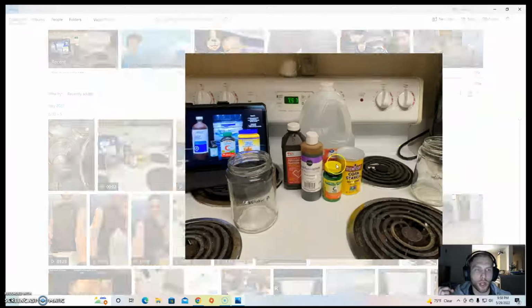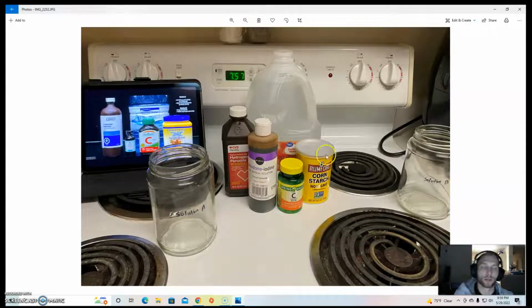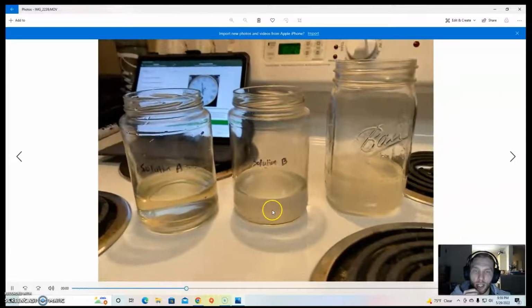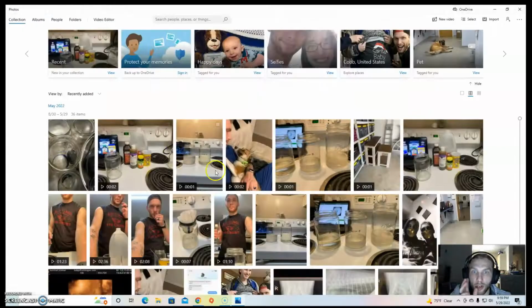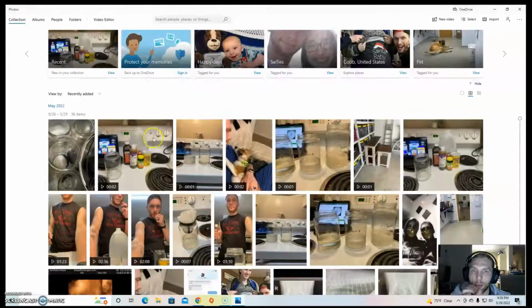This is just a quick view of the setup. It wasn't the greatest material or equipment, but it works. Ingredients. You can kind of see how cloudy this is filtered. It's not as clear as I'd like it to be. This was solution B, still pretty cloudy, and this was them mixed together. This was sitting here for probably 2 minutes and still no color change. So it was very delayed. This was after I filled them up about the same before I mixed them.